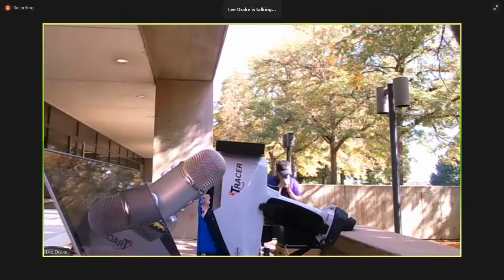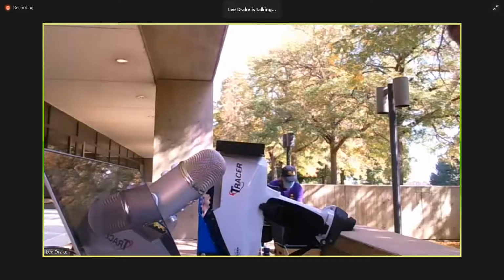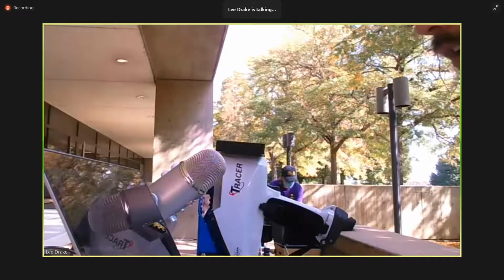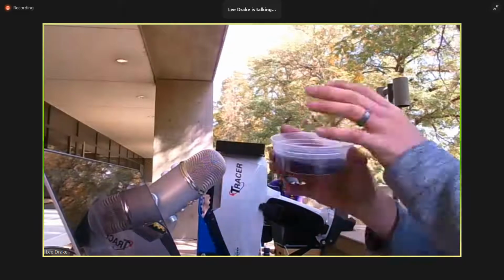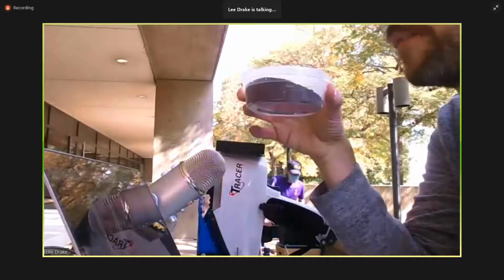Our next object is going to highlight a difference. So spectrum, close spectrum. There we go. So our next object is going to change things a little bit because we're going to measure a little bit of coffee. Now, coffee is one of the most favorite drinks in all the world.